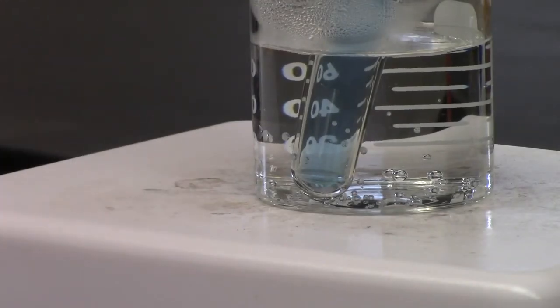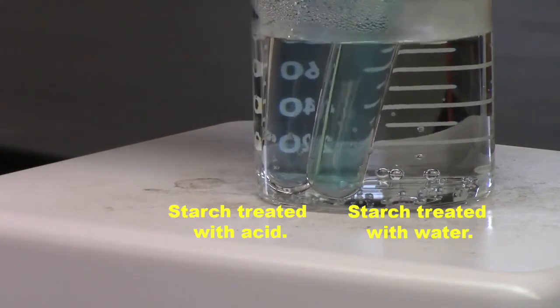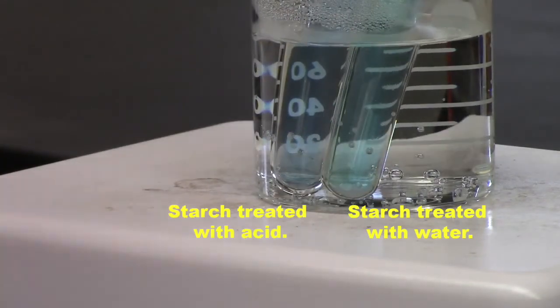Put it into this, the water one here. Okay, guys, that's the water. Water and starch together that we heated up for 10 minutes to near boiling. All right, let's put that in there. All right. Here we go. Let's just sit and wait now to see what happens.